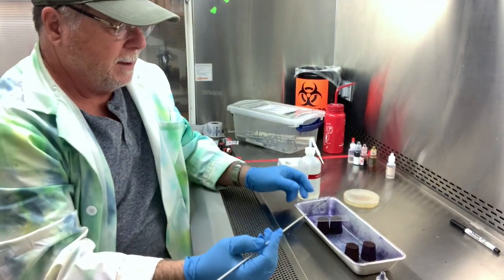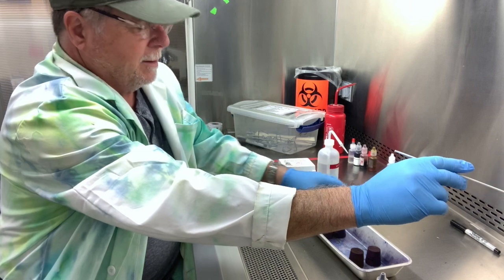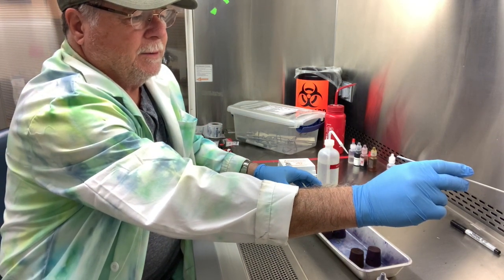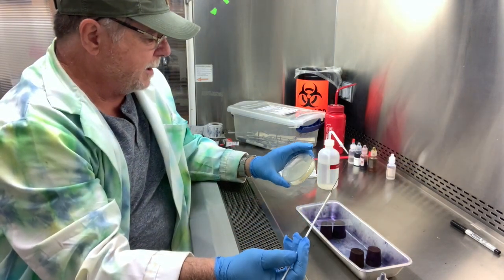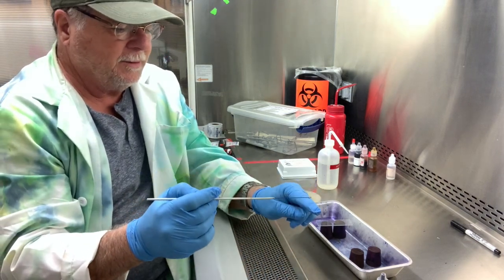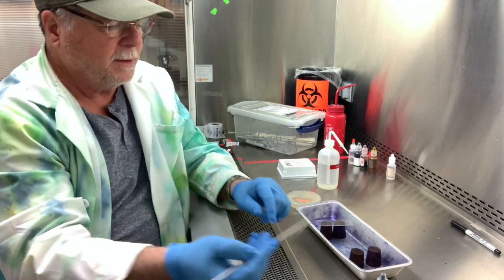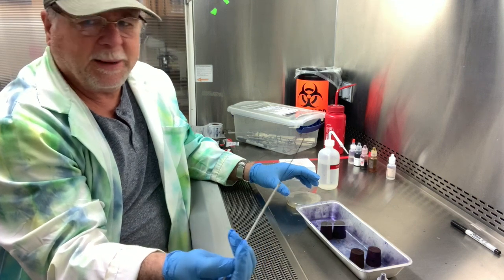All right. Now we're going to go for real into the bacteria colony. So we have to heat that, sterilize that loop, let it cool, and then we're going to go into that one isolated colony and just touch it. And so we're going to go down, and you'll say, so here's the colony. We're just going to touch it, and then we're able to have some. And all you just have to have is a speck on there.